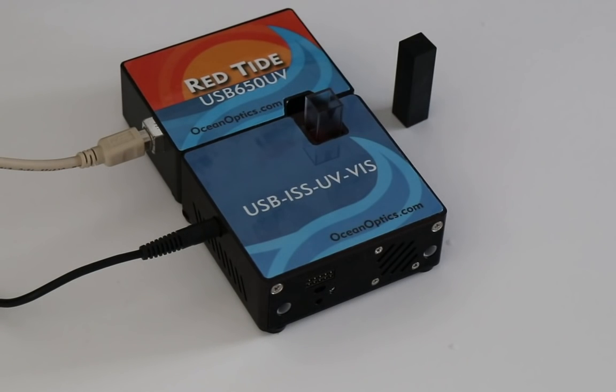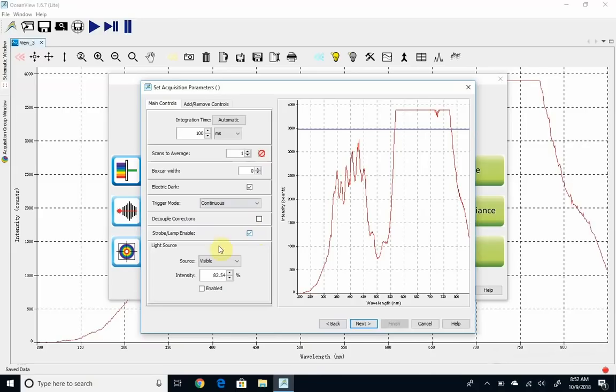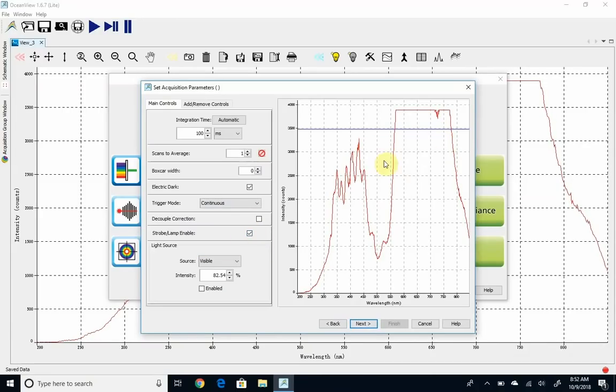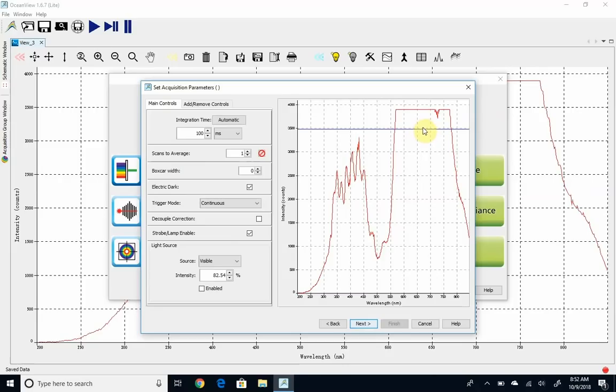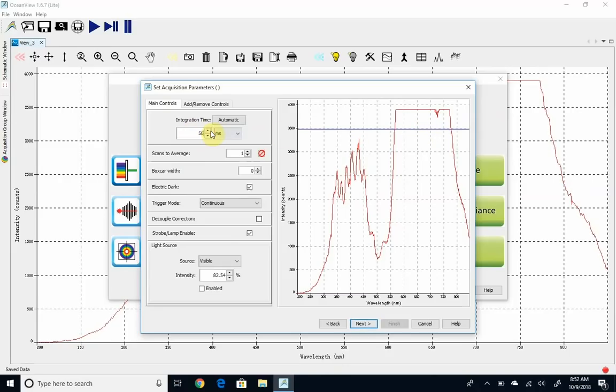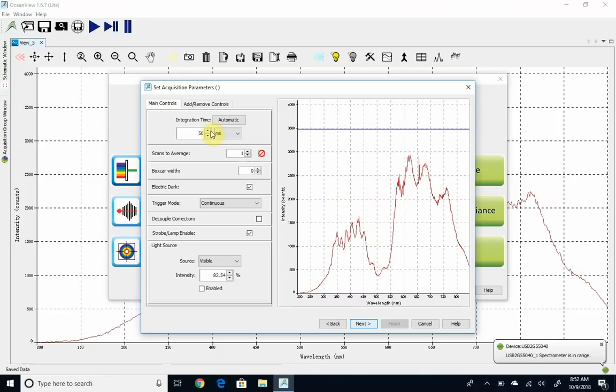As soon as you make sure the strobe lamp enable button is on, you should get something that looks something like this. And you'll see this blue line. We need to adjust things so that our red spectrum, the maximum is somewhere near the blue line. So I'm going to go ahead and jump down to about 50, get it on scale.